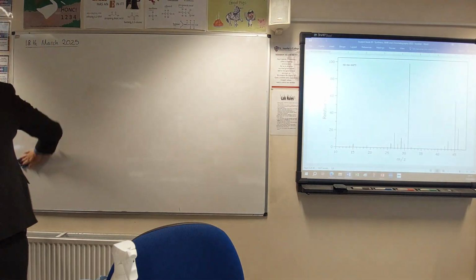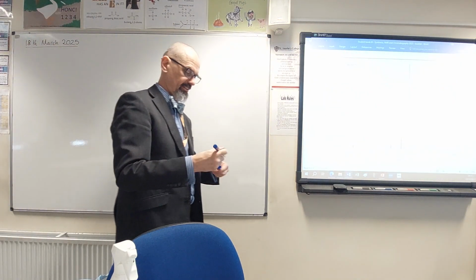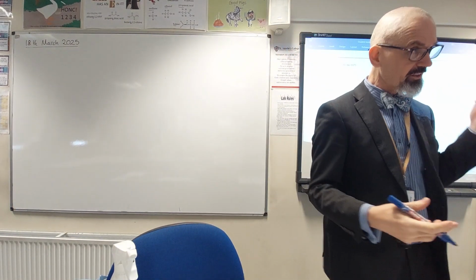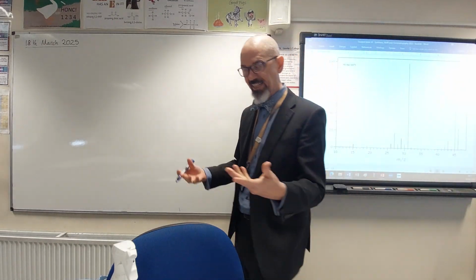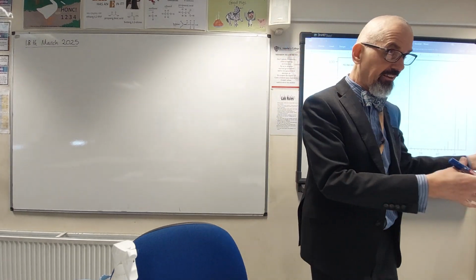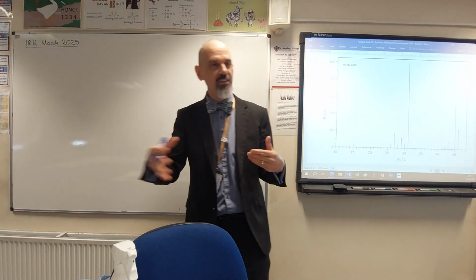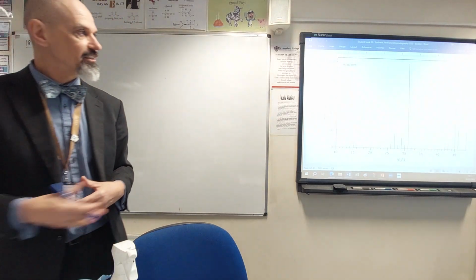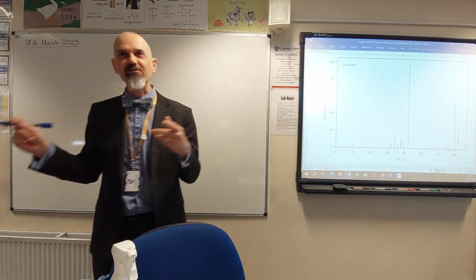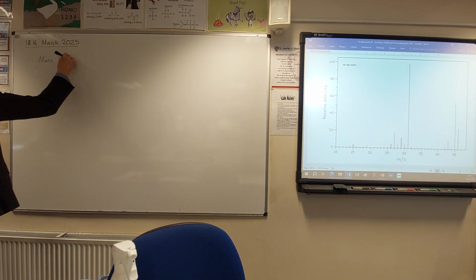I'm not going to go into the whole story about how mass spectrometry works, but you know that if it's electrospray ionization, they dissolve it in a volatile solvent and spray it through a hypodermic needle with a high voltage, and it gains a proton, and that gives it a charge, so it can be accelerated through charge plates, and then it will travel down through a sort of time of flight zone where it's the velocity it has that determines the thing. They all have the same kinetic energy, of course, you knew that. Anyway, you knew all of that. And if you didn't, you're going to do something about it.